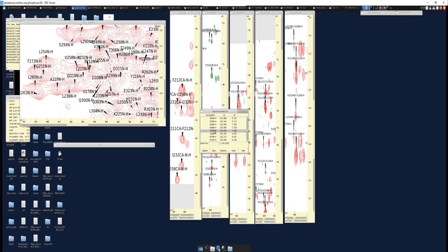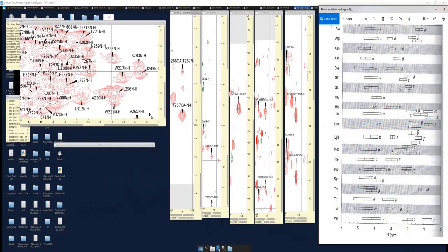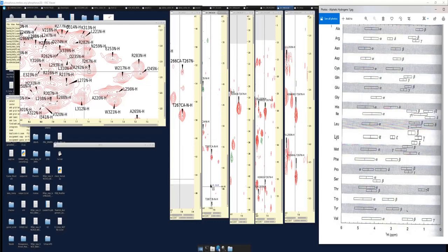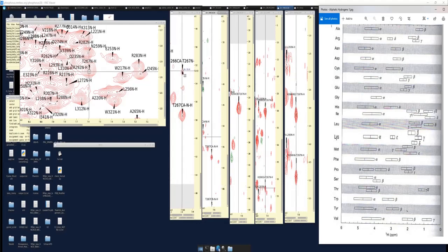Let's look at an instance where the I-1 is a histidine. Okay, right here. So we can see in this instance, we have a threonine, and that's just based off the C alpha C beta. And it's I-1, you have an amino acid that has a peak at 52.6 C alpha and a C beta at around 30.